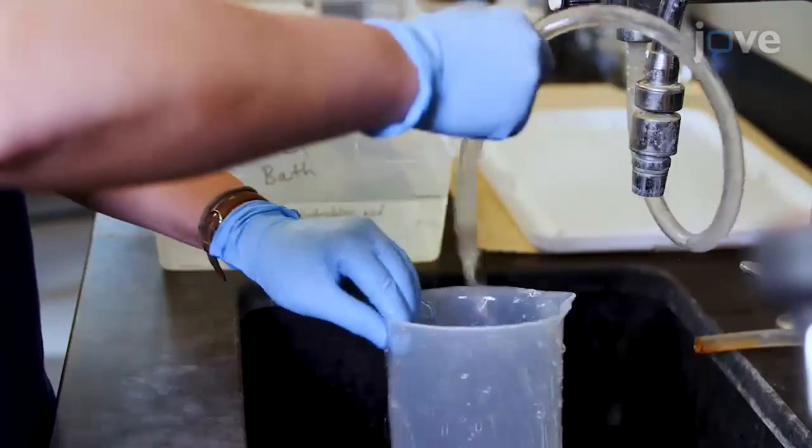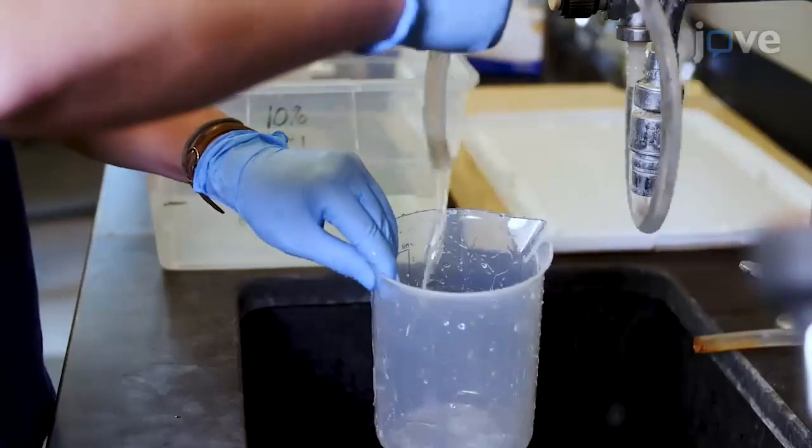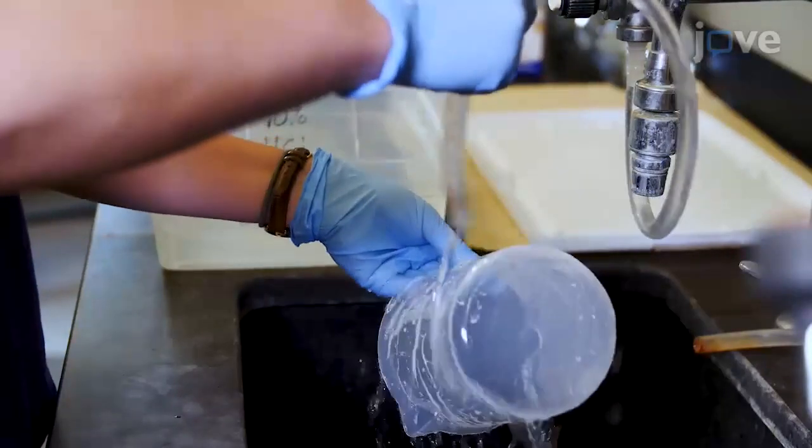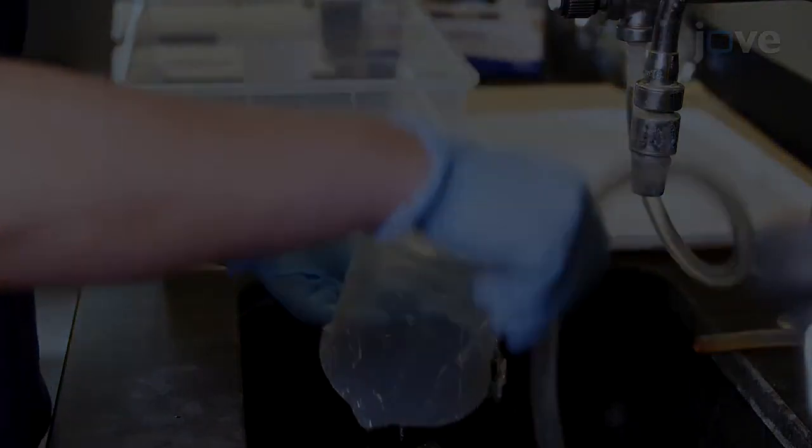Use 1-liter graduated polypropylene or other non-reactive plastic beakers as individual experimental microcosm units. Wash beakers in 10% hydrochloric acid and triple rinse with distilled water.